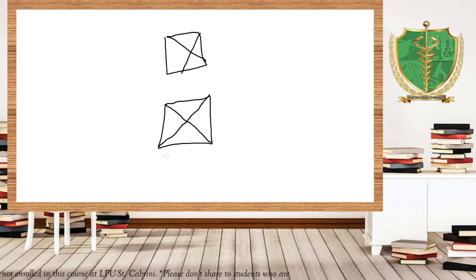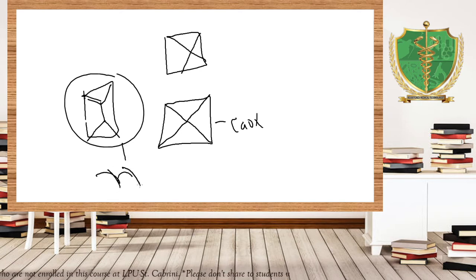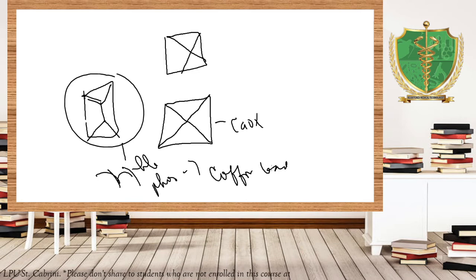Yan. Ganito po si calcium oxalate. This is calcium oxalate or CaOx. Si triple phosphate is a rectangular or square structure, no? At yanan siya. Para siyang coffin lid, no? This is triple phos. No? Ito po ay coffin lid. Kabaong. Anong lid? Lid. Ano ba spelling mo? Basta coffin lid.